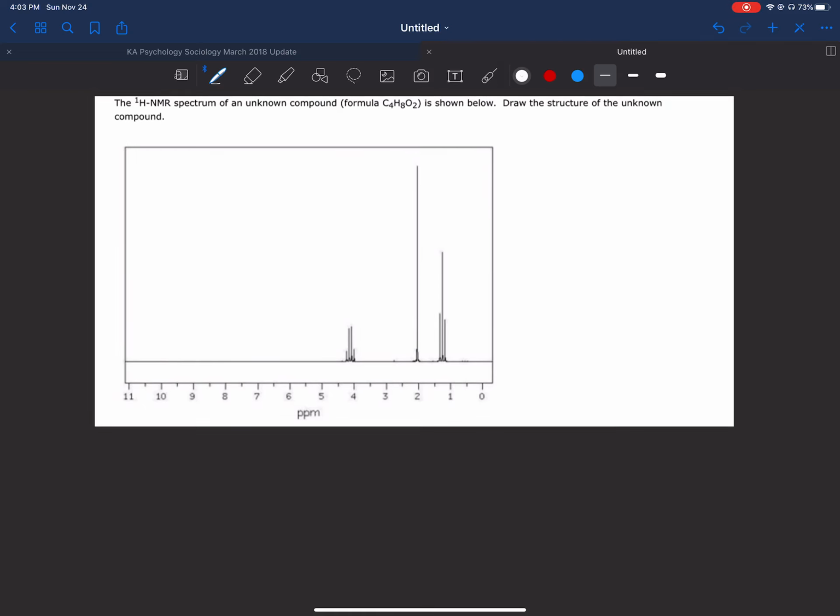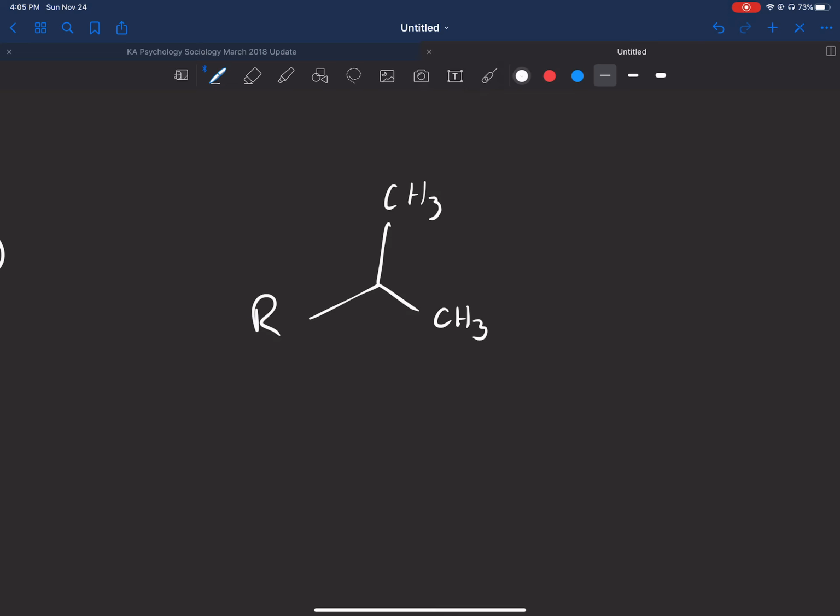Now there's an isopropyl split, which looks like this. This is the isopropyl. So those 2 methyls, remember, they're exactly the same. So the HNMR is only going to pick up one of the hydrogens here. I'll actually draw the hydrogens out. Here's the carbon. They're all bound exactly to the same carbon, bound to that middle carbon right there. So they're considered the same. So all 6 of them are identical. So there's going to be one signal for them. And the other hydrogen that we have to look at is that one right there.